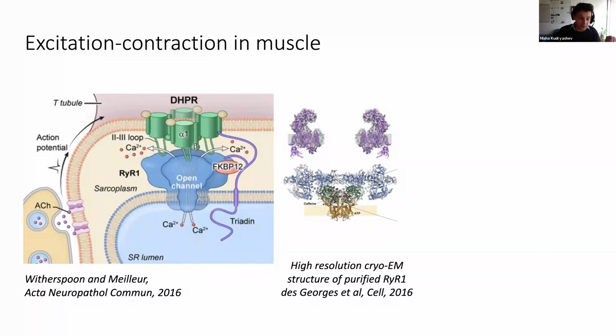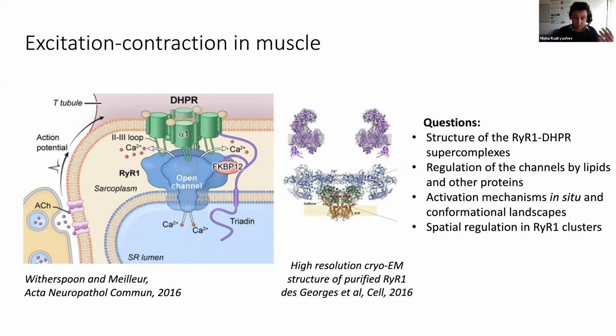So the structures of the key players have been solved in their purified forms, but we actually wanted to look at the structures of the supercomplex and how they interact inside the native membranes. And obviously, it would be super exciting to visualize how the physical interaction of the two channels leads to cooperativity and to the function.